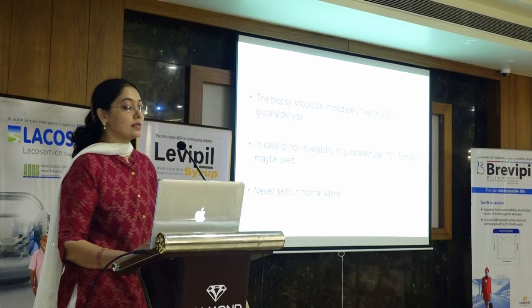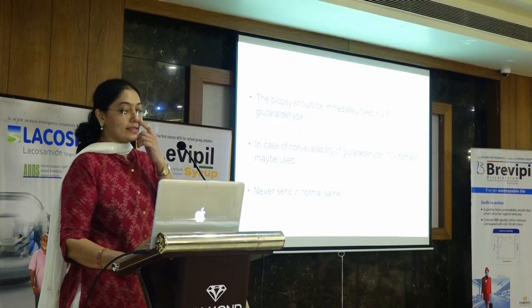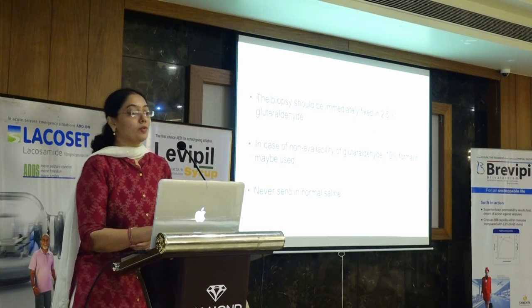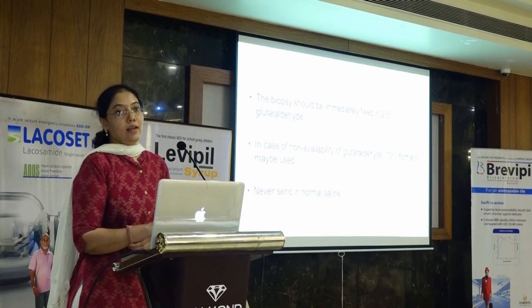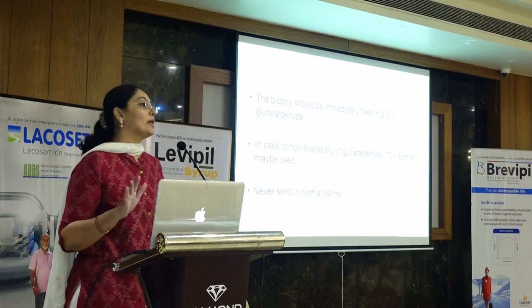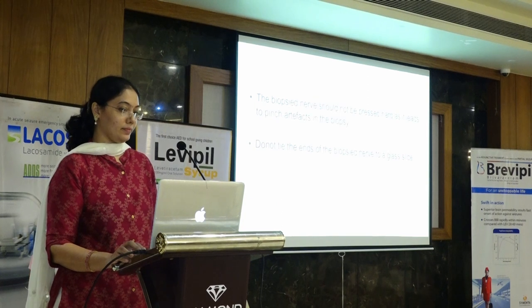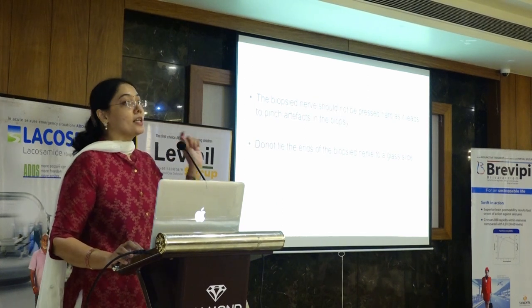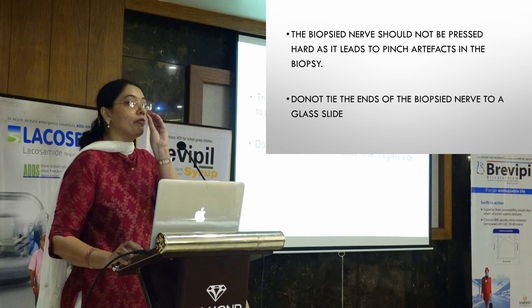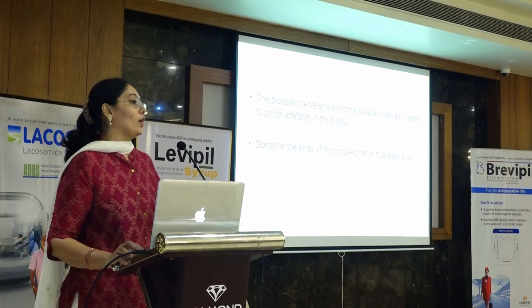Glutaraldehyde is preferred over formalin. If glutaraldehyde is not available, 10% formalin can be used but never saline. We prefer glutaraldehyde because if electron microscopy becomes necessary, formalin leads to artifacts under EM. Also, once the biopsy is done, it should not be pressed hard because it leads to pinch artifacts — a big blob of myelin will be seen in cross sections and we won't know whether to consider it axonal injury or artifact. Do not tie the ends of the biopsy nerve to a glass slide, as it will pull the nerve.